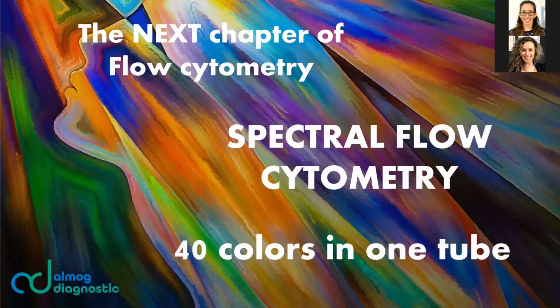So actually, we have come to the end of our talk. I do want to show you one slide about the really exciting new innovation in the flow world. We call it the next chapter of flow cytometry. This is actually spectral flow cytometry.